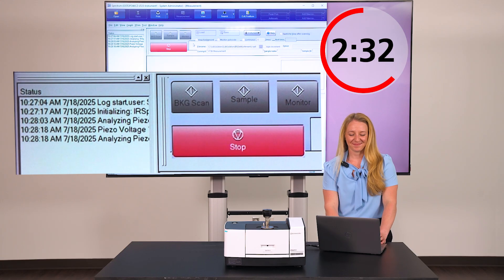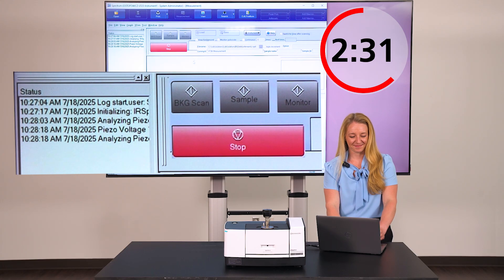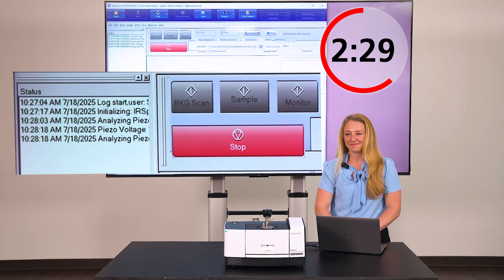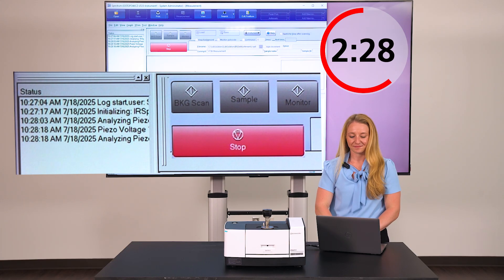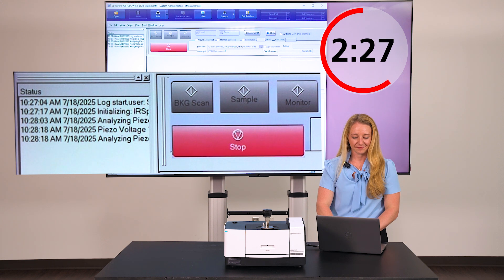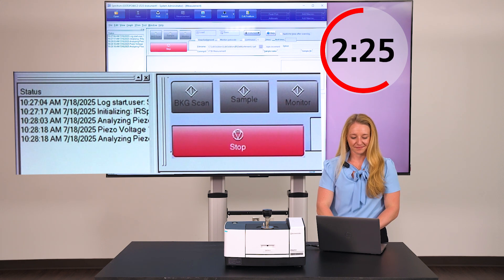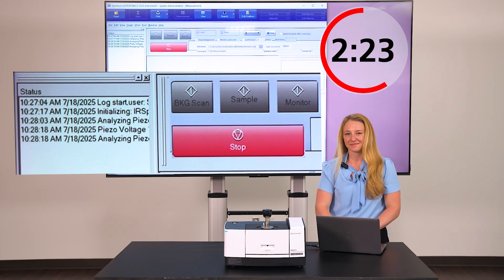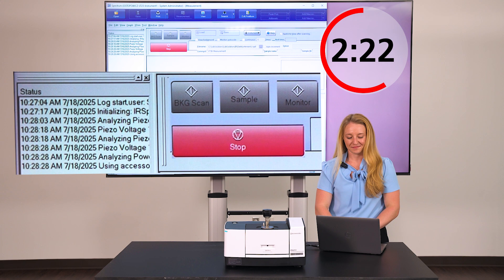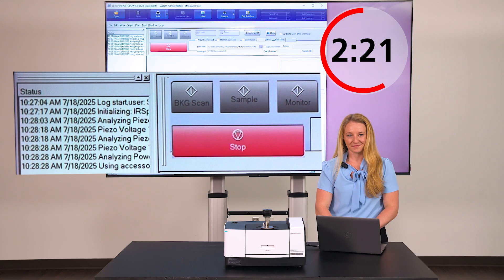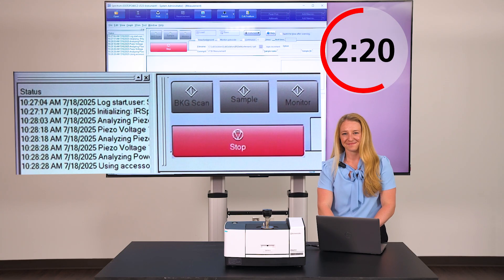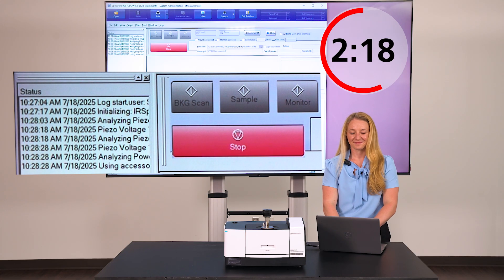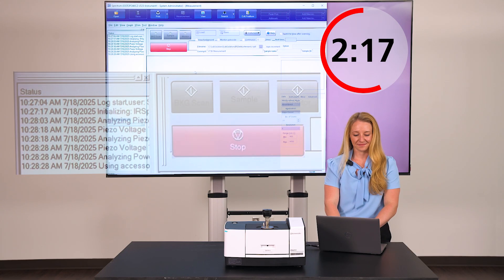Future Lauren again. The interferometer's optics are automatically aligned based on the reference laser signal, making the laser stability a critical component to check. These fine adjustments are performed by piezos, which move the optics with tiny voltage-controlled steps. The piezo status is displayed in the window shown here.